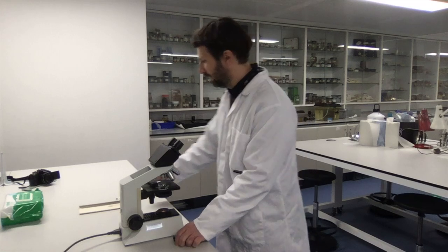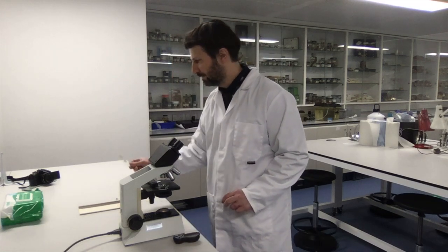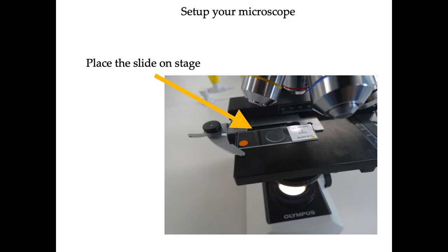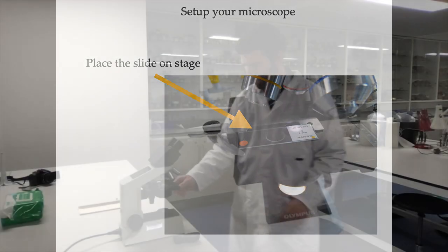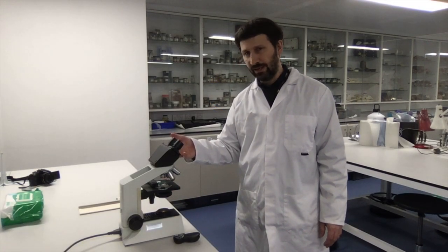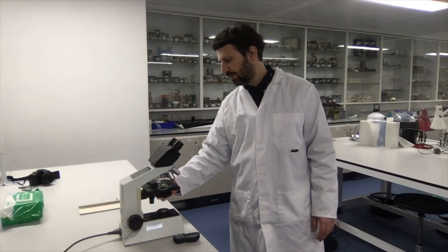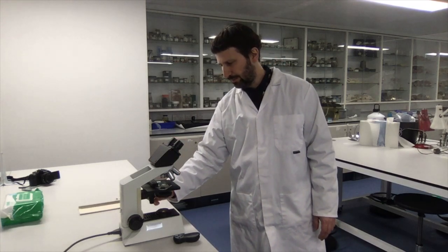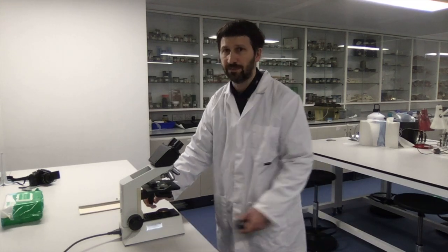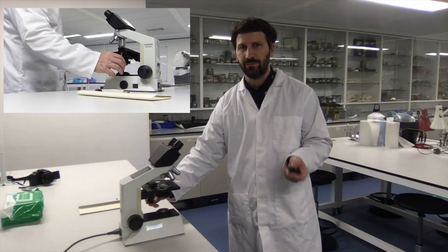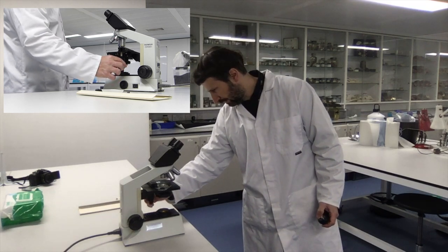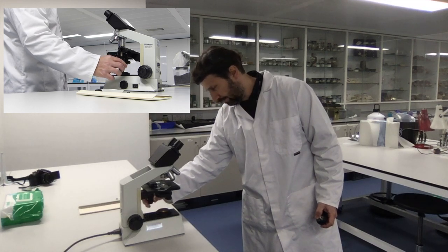Then you start by putting the microscope slide on the stage of the microscope, as I'm doing here. What you should do before even starting to look inside the oculars is set the position by moving these X and Y knobs to adjust the position of the slide on top of the light source.